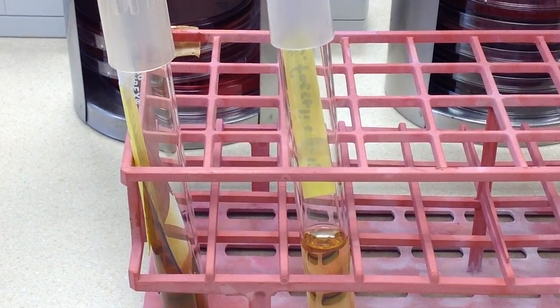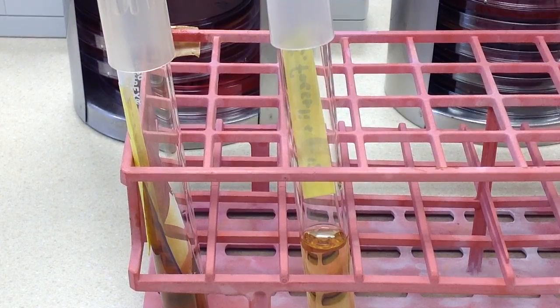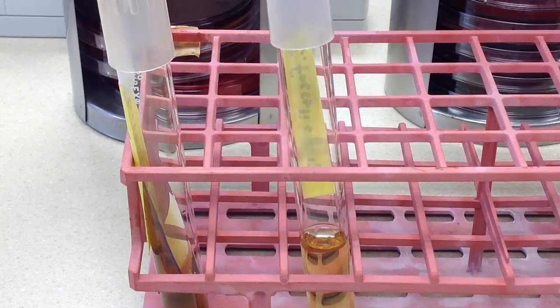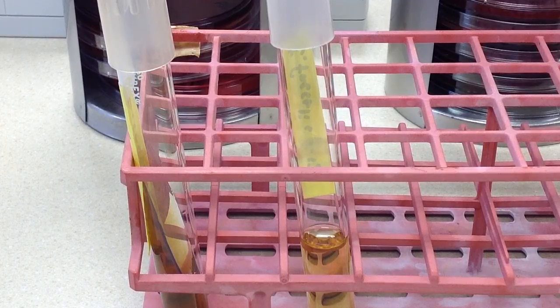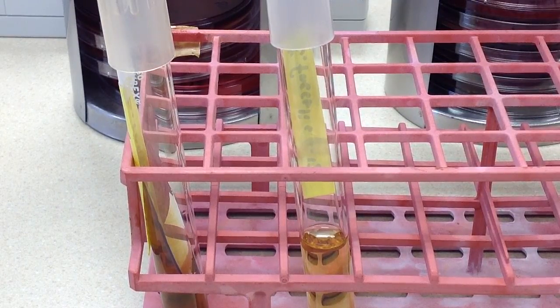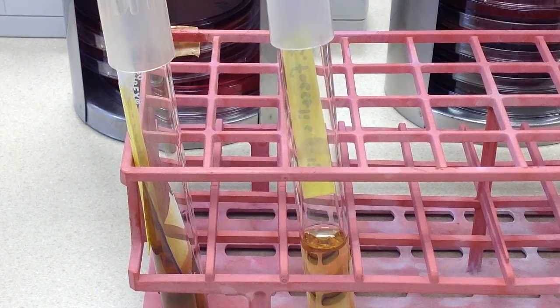In this video we are going to take a look at inoculating a broth, in this case the 6.5% sodium chloride broth for the identification of Enterococcus, and then we are also going to inoculate the slant bile esculin, which is also for the identification of Enterococcus.